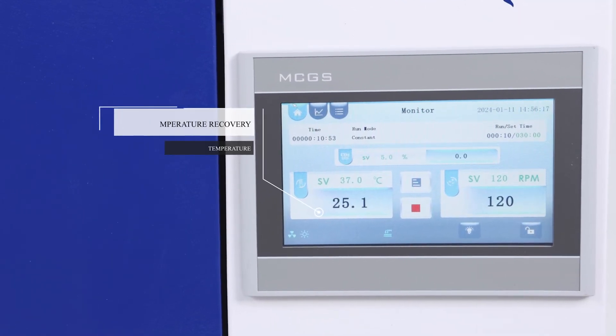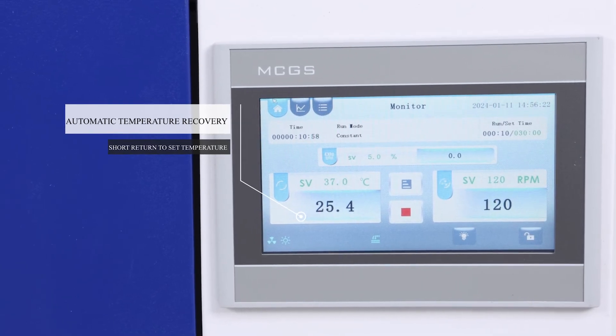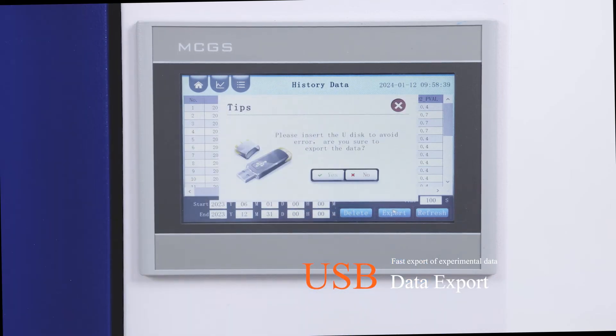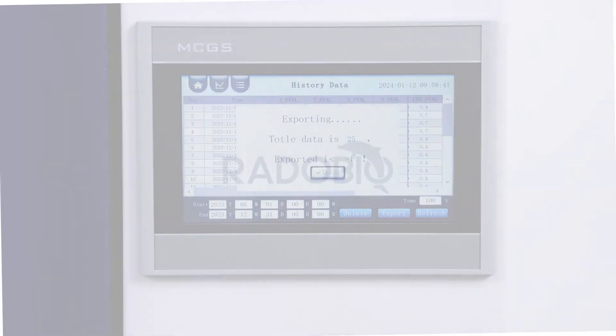Automatic temperature recovery with short return to set temperature. USB data export allows fast export of experimental data.